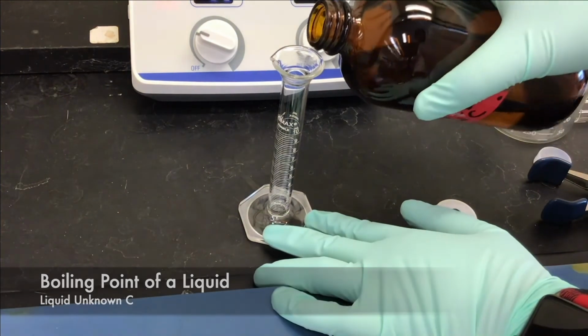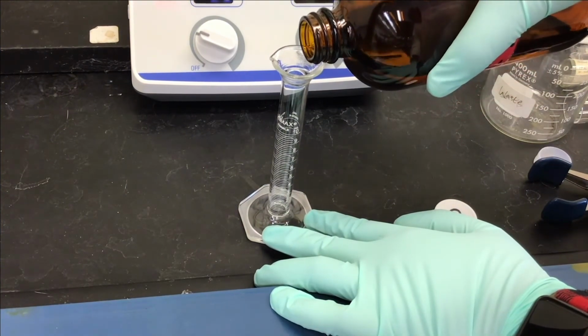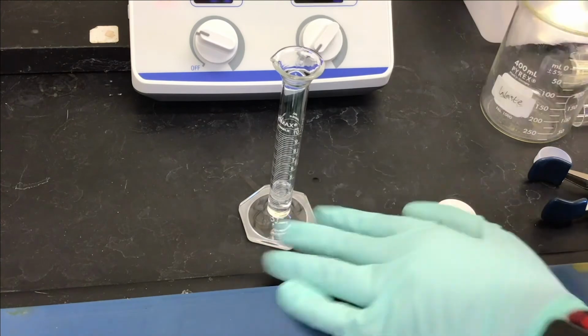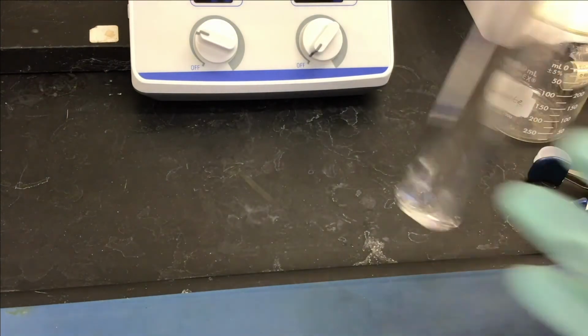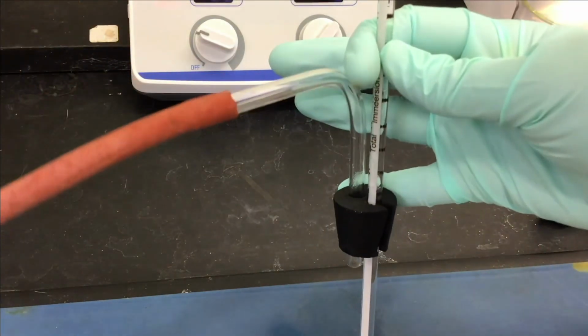First, we're going to measure 3 milliliters of our unknown liquid. Now we're going to prepare our 2-hole rubber stopper that has a slit.